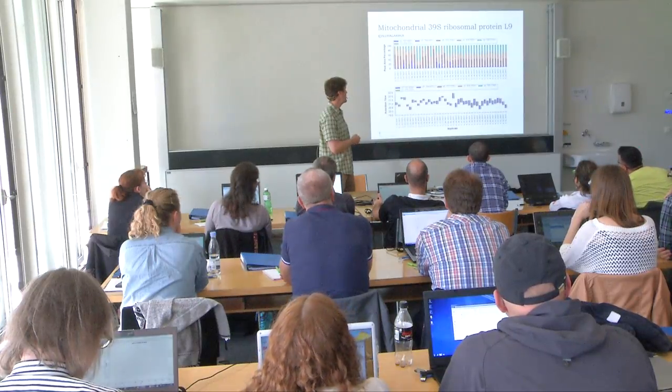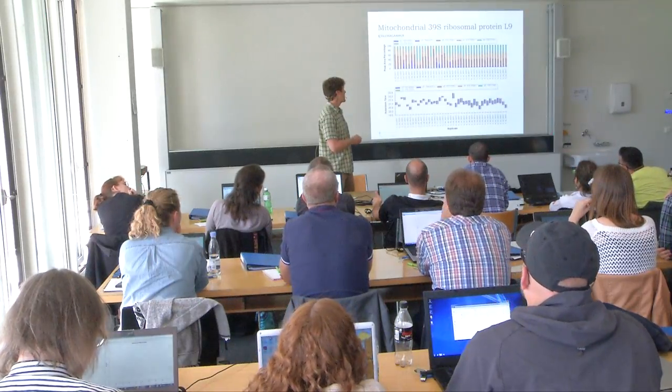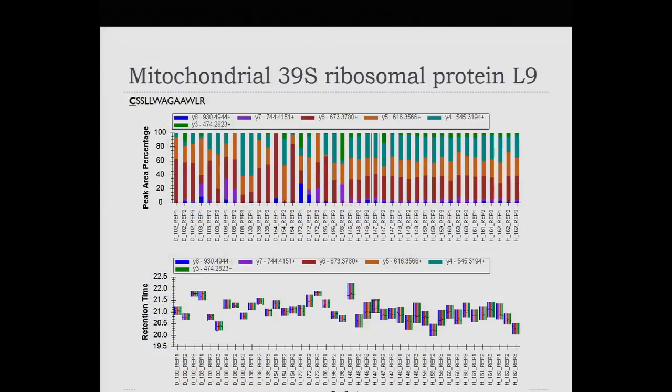But so is it a complete and total loss? I think if all of the data looked like this, we would just throw this away and say, well, this is not a quantifiable peptide.